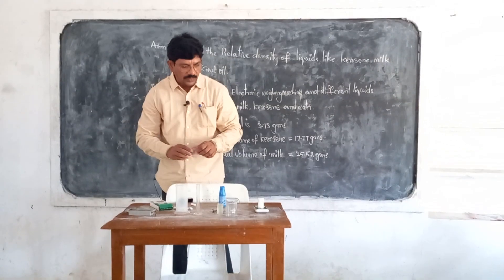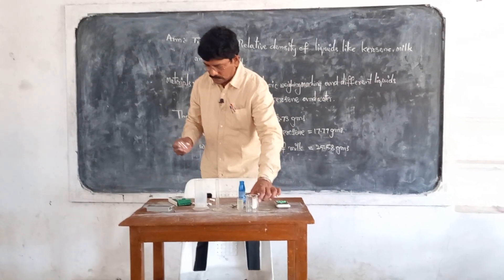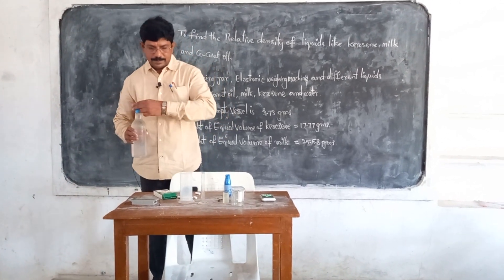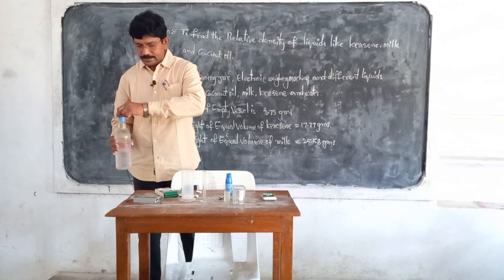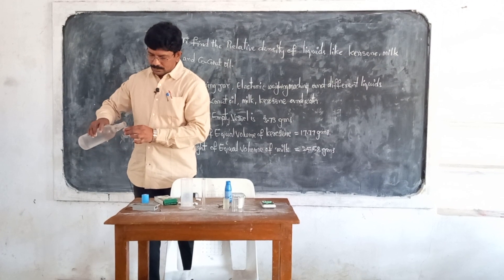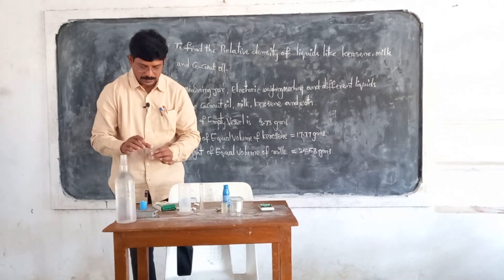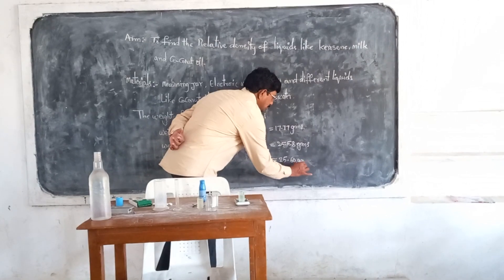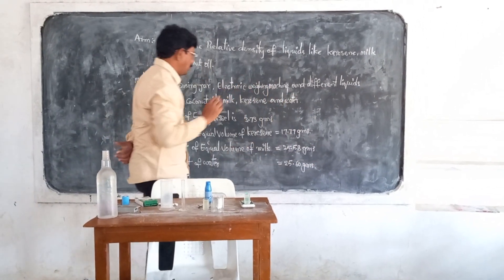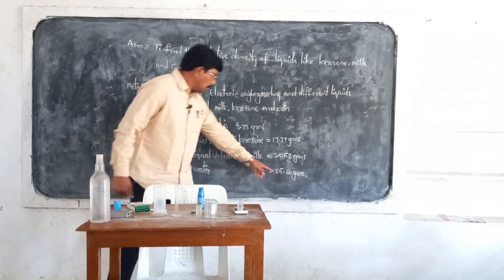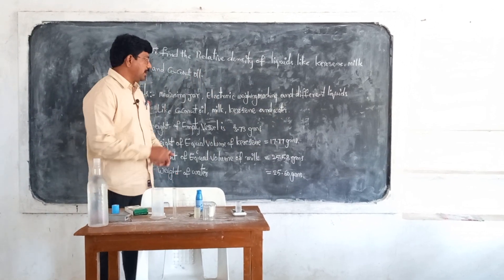Now I am taking some water to measure its weight. The weight with the water is equal to 25.60 grams. So the weight of water is 25.60 grams.